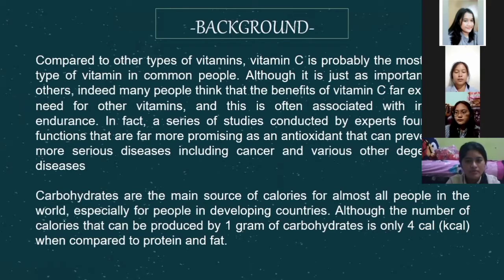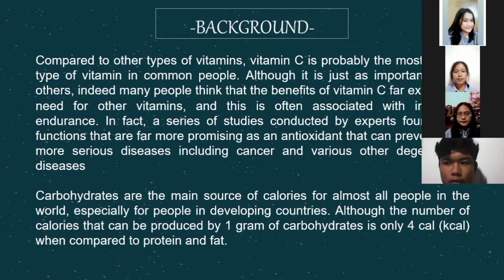Background. Compared to other types of vitamins, vitamin C is probably the most popular type of vitamin among common people, although it is just as important as the others.